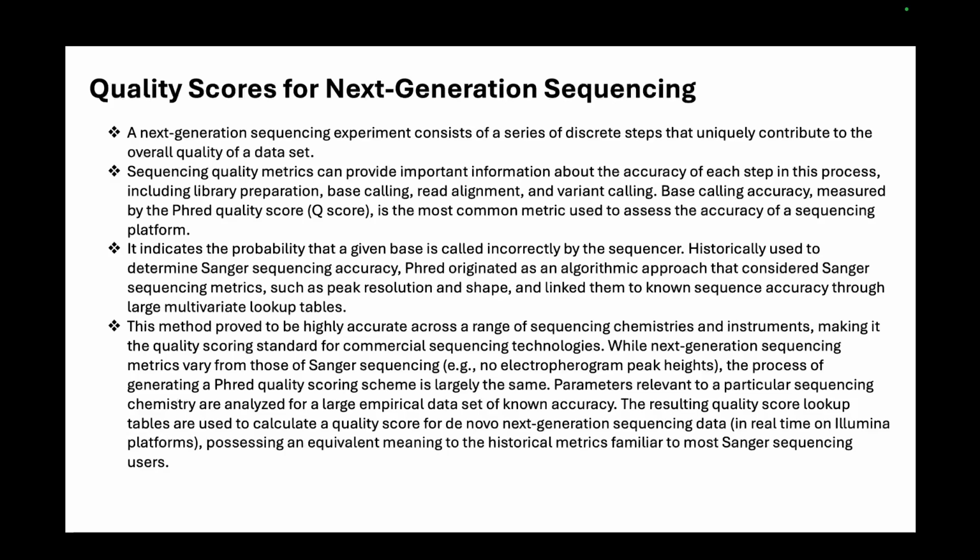Basically, what we do is we try to identify the signal and identify which nucleotide actually caused that signal. So, in this step, we'll learn how to do that.